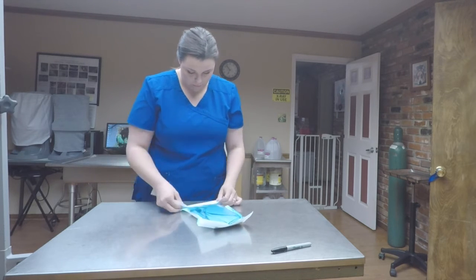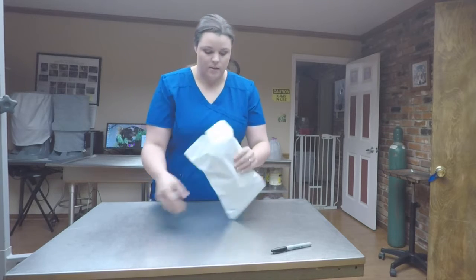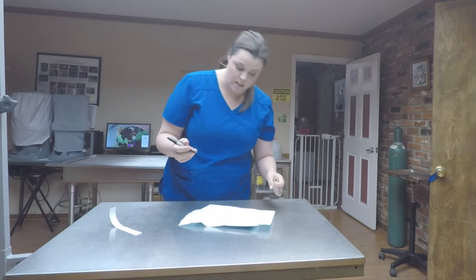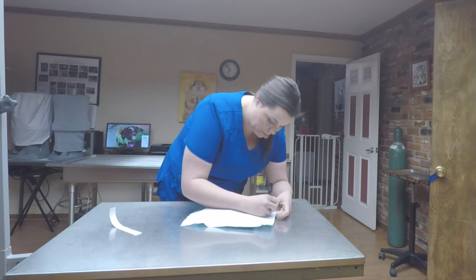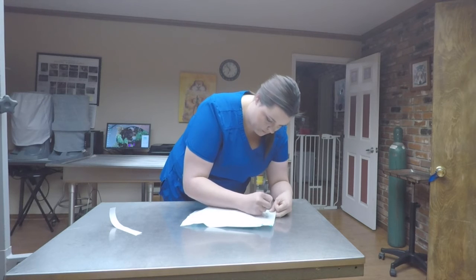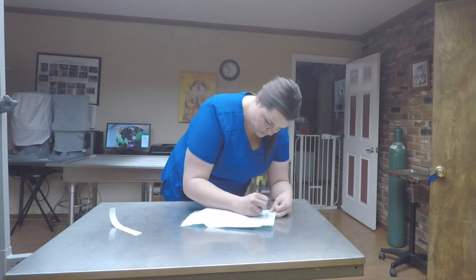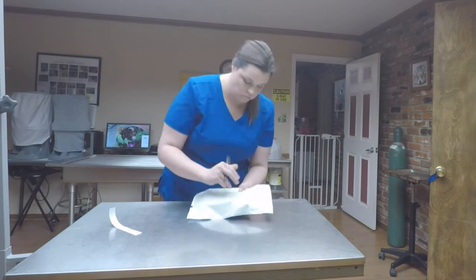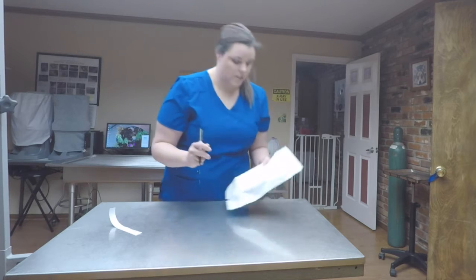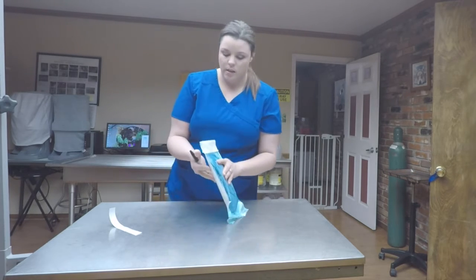Seal it. And then on the other side, you will write what it is, the date, and your initials. Just like that, and then it's ready to go in the autoclave.